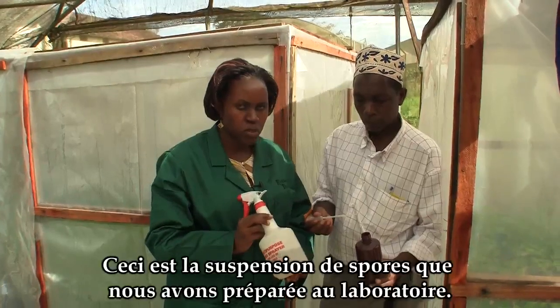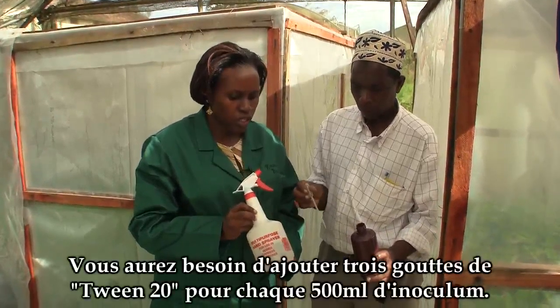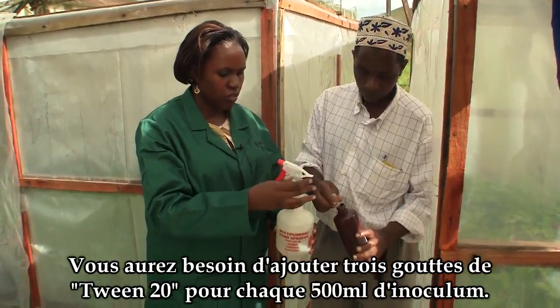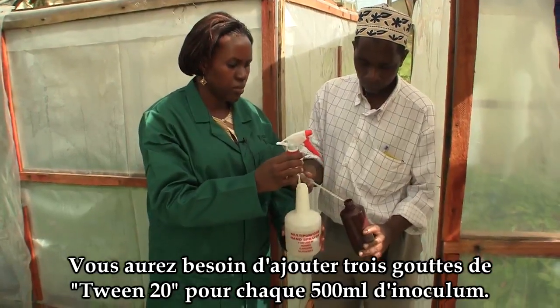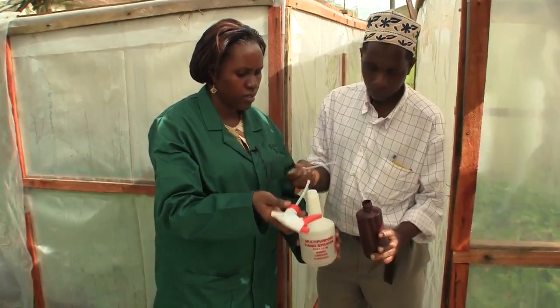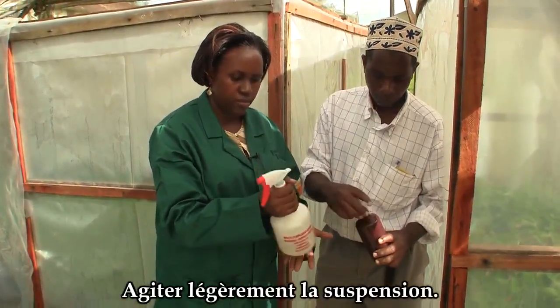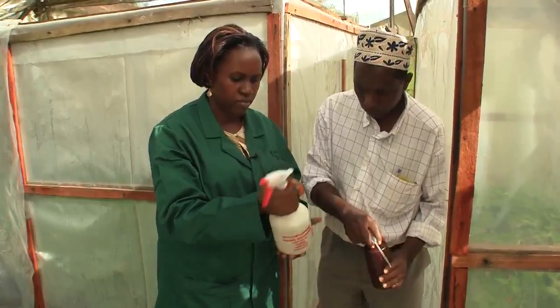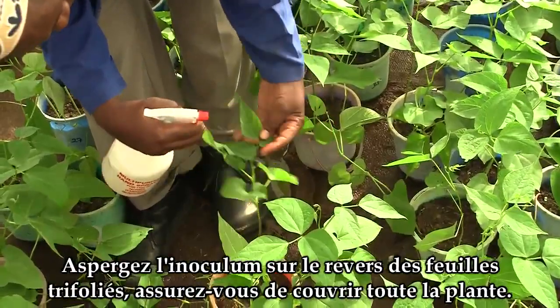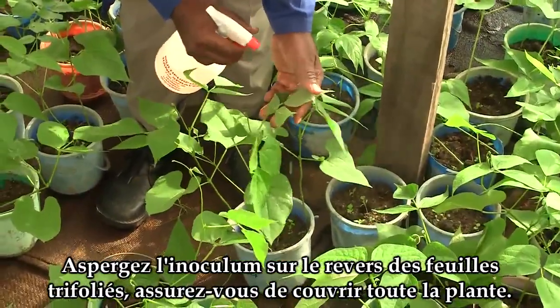This is the spore suspension that has been prepared in the laboratory. To inoculate, you will need to add Tween 20. To 500 millilitres of the inoculum, add three drops of Tween 20 and shake. Spray the inoculum on the underside of the trifoliate leaves, thoroughly covering the plant.